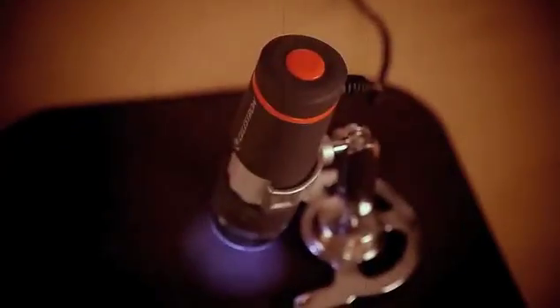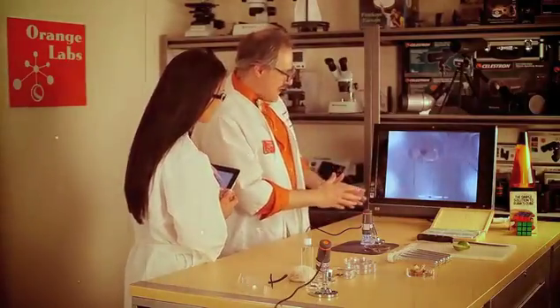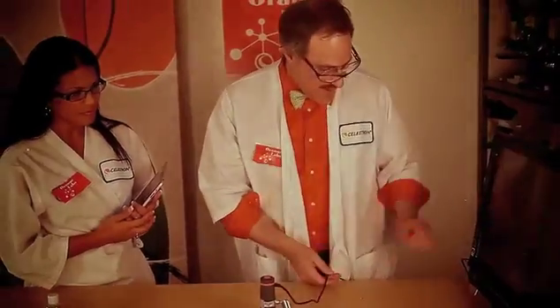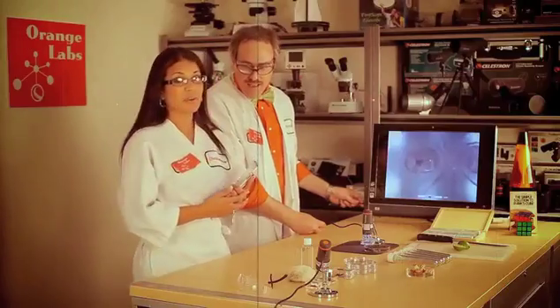This amazing gizmo plugs directly into your computer and allows you to view all kinds of things right on the screen. It's got this great stand that allows me to position it in all kinds of different ways. It's connected via this nifty universal serial bus connector. You mean USB port, right? That's what I think I said — a USB.